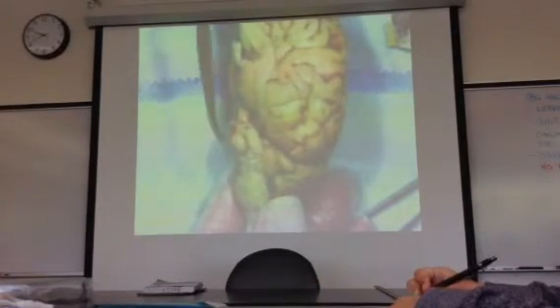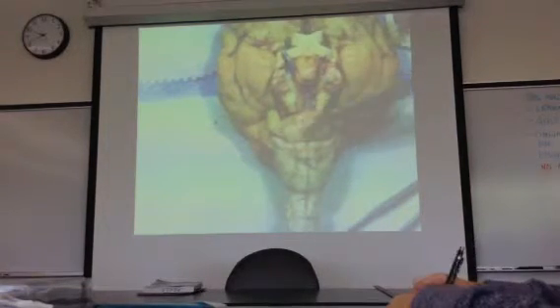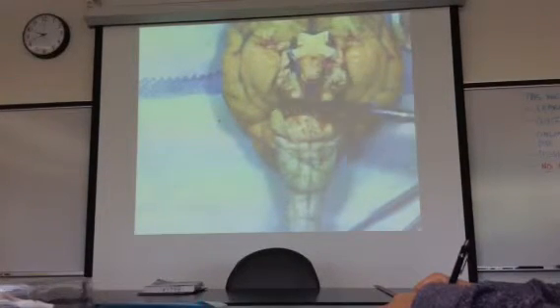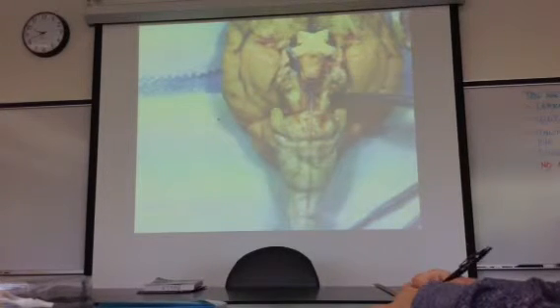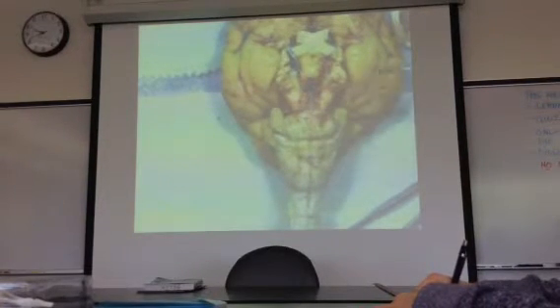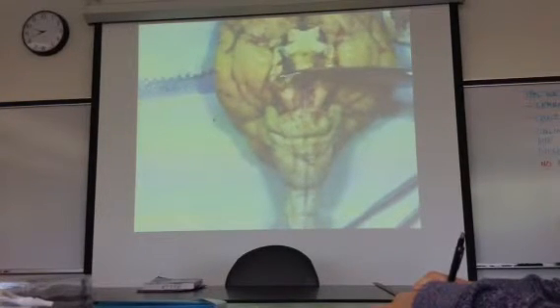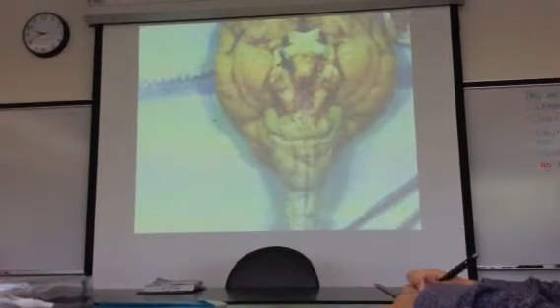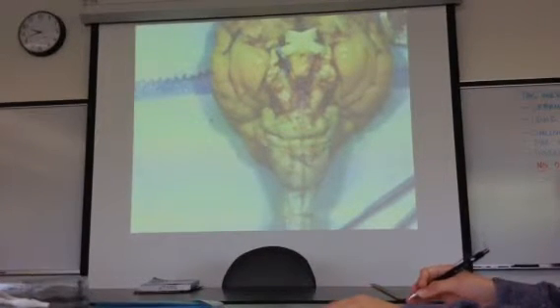Let me turn it. Can you guys really see that bump right there? This bump is called the pons. So cerebral peduncles extend on the sides, okay? Just a little lateral to midline, relatively speaking. This is a cerebral peduncle, this is a cerebral peduncle, and these oculomotor nerves lie on the cerebral peduncle. They cover part of it, although they're really small. Any questions so far? Okay.